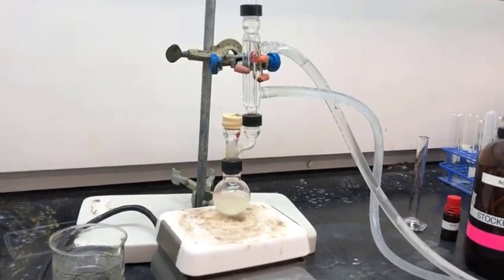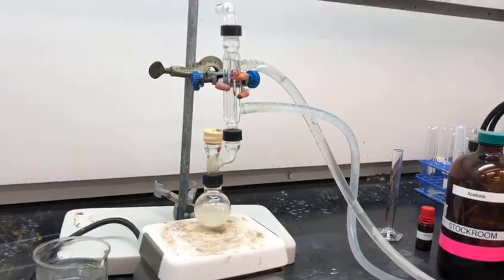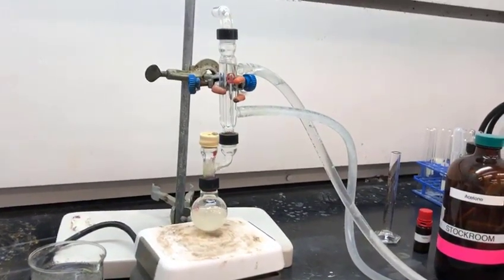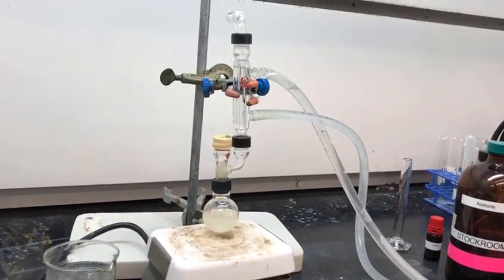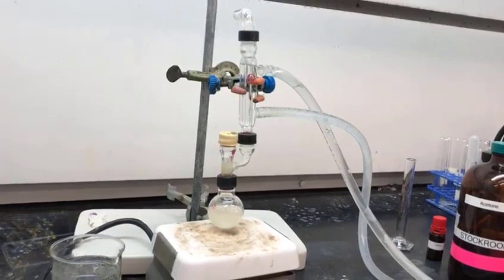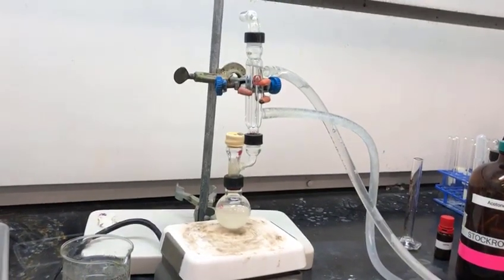After one hour of allowing our reaction mixture of sodium borohydride, 1-hexene, and the iodine to react, you can see that we have this clear — or more accurately opaque — solution.